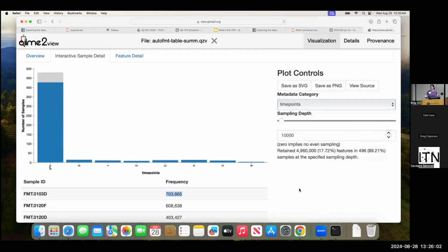That's only super possible when you have replicates within a group, right? Like I'm willing to lose some of these controls because I know I have more. With a study like this, it becomes hard because you have time points. And so if you start throwing out samples, you could lose a subject at that time point and you don't have any replicates of that. And that tends to be where I switch my favoritism and I want to retain samples and I'm okay investigating a little less. So I think it is a balance that you have to figure out per study. And in this case, I am going to prioritize keeping samples so that we're able to investigate a subject throughout time more effectively.